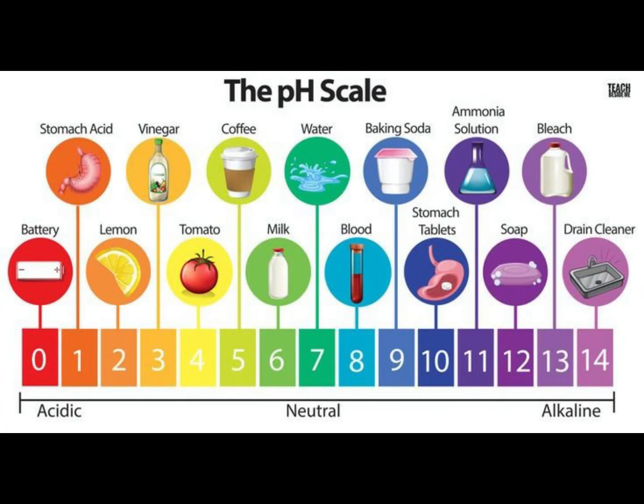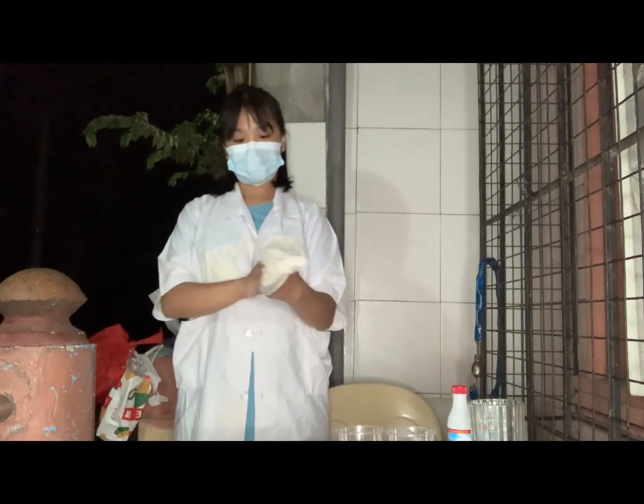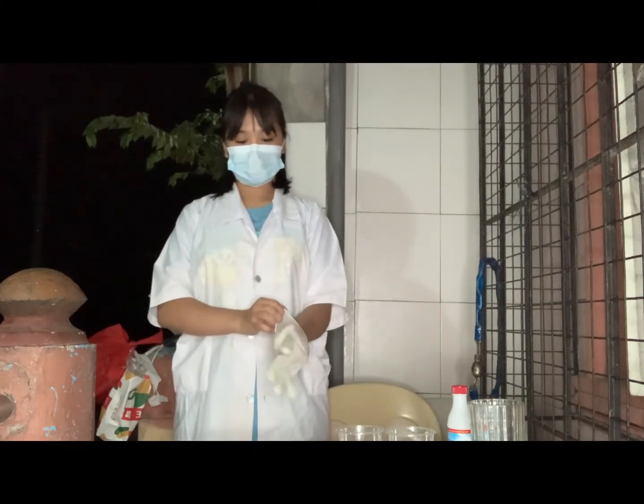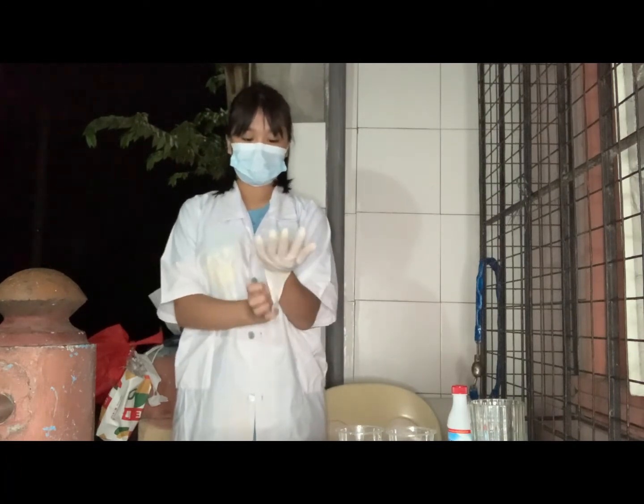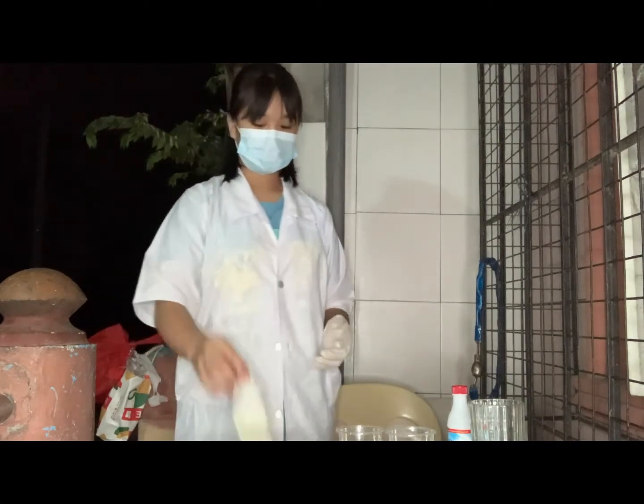Hi, I am Mary Quincy, an FEU Medical Technology student, and today we will be doing a base experiment about pH indicators. But first, let me remind you to wear personal protective equipment since we will be dealing with some chemicals. Always remember that wearing personal protective equipment is the most important thing when we are doing an experiment to avoid harm and illness.